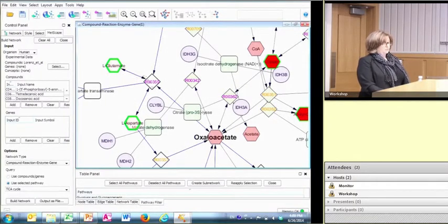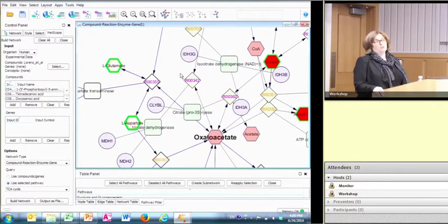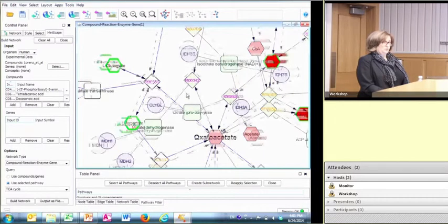And by the way, what I haven't mentioned, but you probably noticed, is that some of these arrows are double-headed, and some of these are directional. Wherever we have the information about the reaction, whether the reaction is reversible or non-reversible, we represent that with arrows, okay? And so you can see that glutamate and aspartate just got added to this network. These are expansion compounds, that's why they're pink, but this green border really shows that they were in our experimental data set. And again, Bill is going to go through all these features in a lot more detail on Thursday.